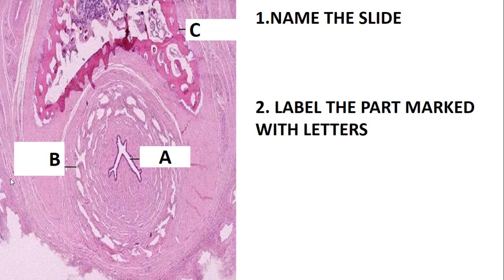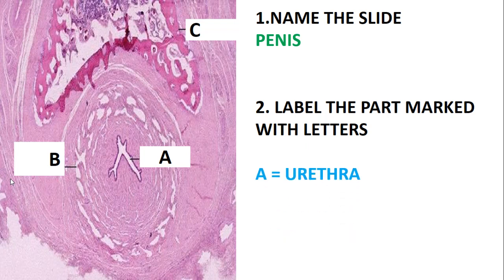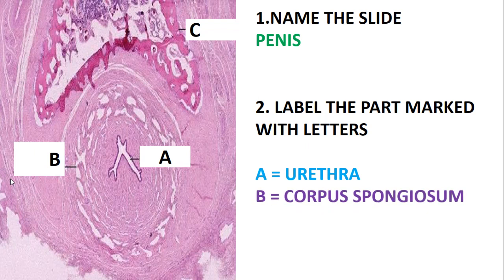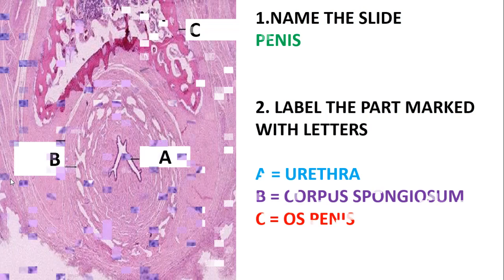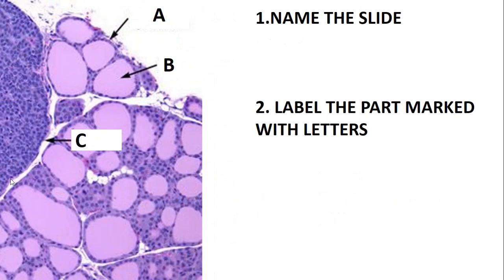This slide is the penis. Label the parts marked with letters. A is the urethra, B is the corpus spongiosum, and C is the os penis. Let's quickly move on and look at the next slide.